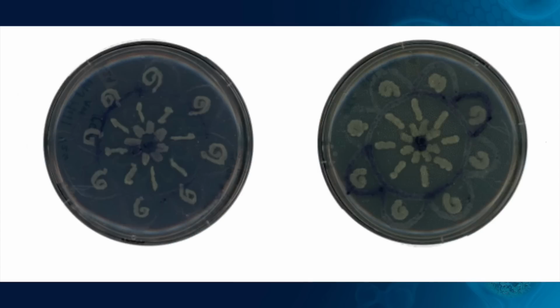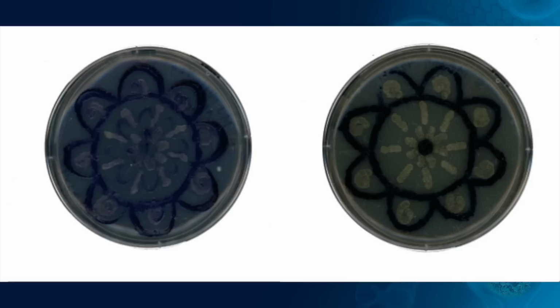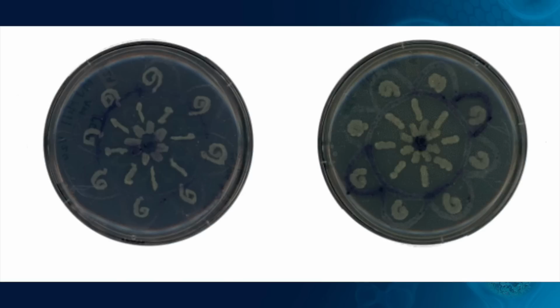So what's happening here, Sarah? Yeah, so similar thing, the same design is painted on two different dishes, and this is a time lapse. So there's, I think, day 0, day 1, maybe 3 days out, and a week later. And you can see how, even though it's the same image using the same bacteria, they create drastically different results depending on the media. So you can see on the left that the Chromobacter, I don't remember what the white one was, but they're sort of melding together in ways they don't do on the right. And so we think that the things you can use bioart or agar art for aren't just limited to aesthetic objects, but can really tease out scientific, interesting facts about the microbes or the things that students or other people are working with.